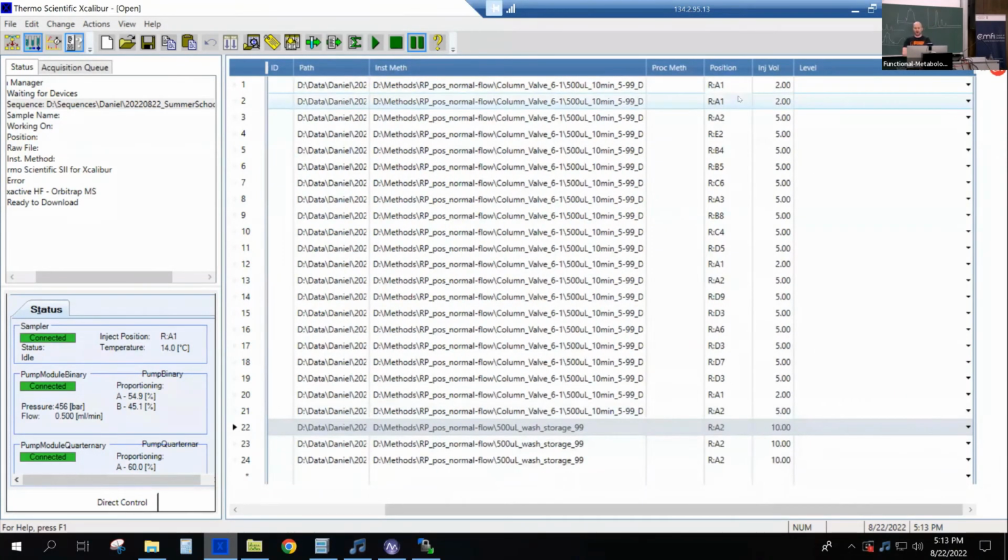To be honest, we use two types of chromatography, normal flow and microflow, and I don't want to make QCs for both. So we have it in a range that we can also use it for microflow, and that is better with smaller injection volumes. Now it's pretty concentrated, so at 2 microliters I get a good signal. But for the other samples, this is actually a normal flow method, you can see at 500 microliters per minute, the default injection volume would be 5. I think in an ideal world, we would have the same injection volume. But maybe I'm just an amateur.